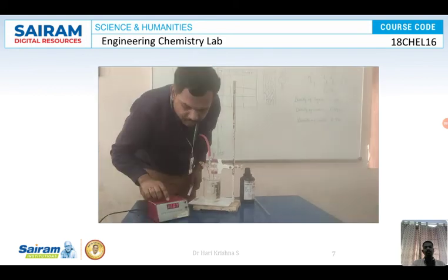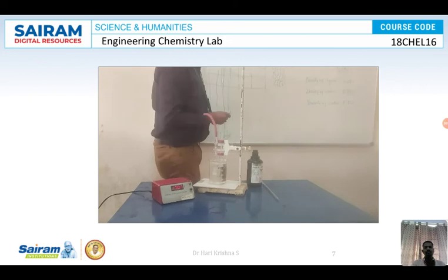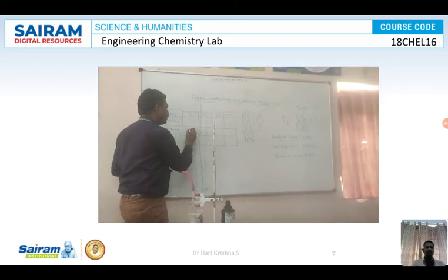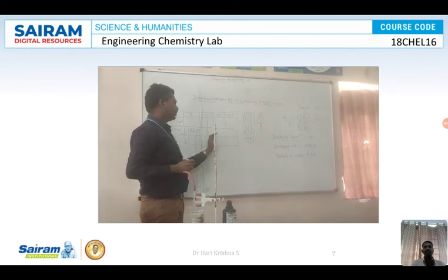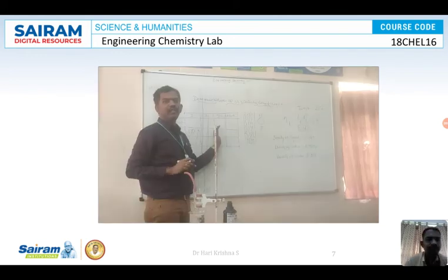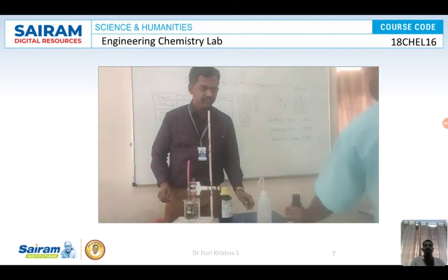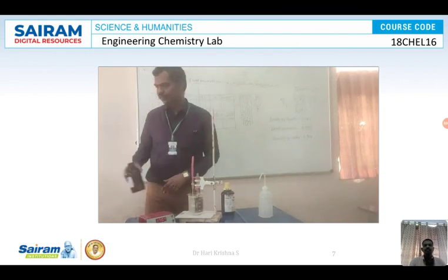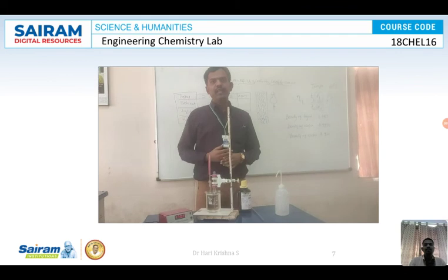So it has 110.7. That is the liquid. 110.7, so we can record 110.7 seconds for the liquid. Similarly for the other trials. So we have done with the liquid.